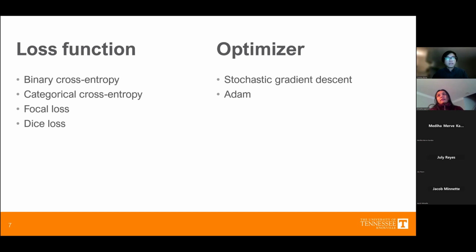Yeah, so simply because of the binary nature of background versus bubbles, when I did it, I was looking at binary cross entropy. I was also looking at focal loss, which is a modification of the cross entropy function. In theory, it's supposed to support class imbalance better, but it didn't perform as well. So perhaps it's because of the much smaller data set compared to, I guess, when they do self-driving or that kind of data.